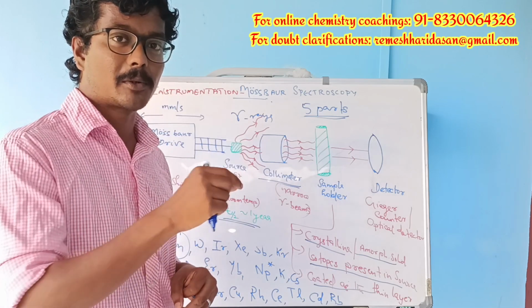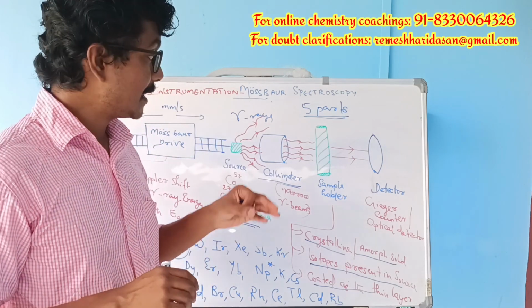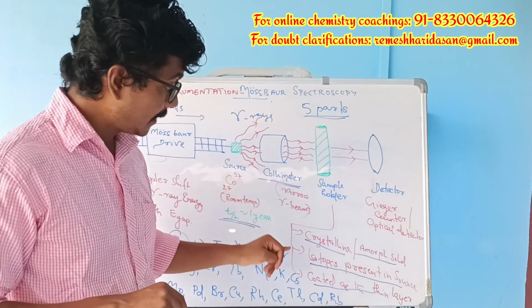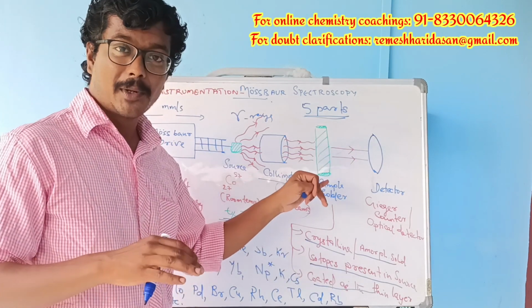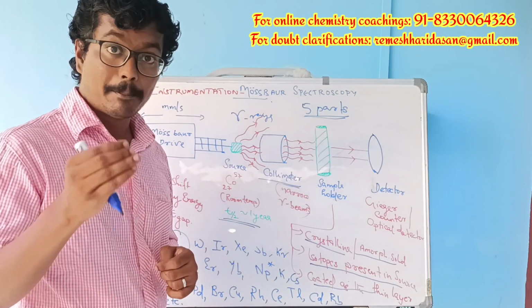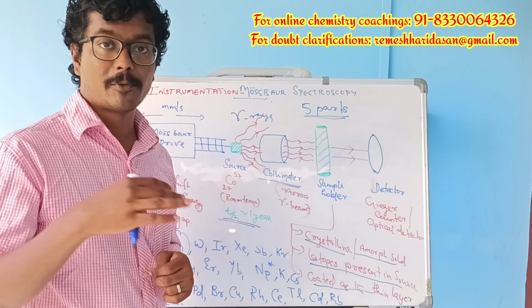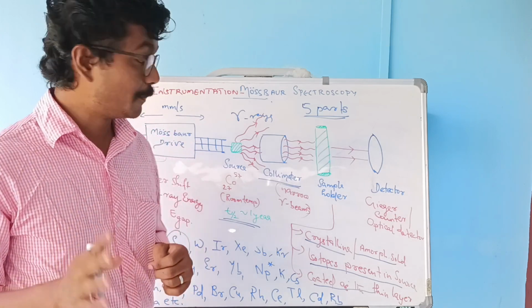So a separate sample preparation is not required, and we do not require a large quantity, but it is non-destructive in nature. We can utilize the same sample for other analysis also.